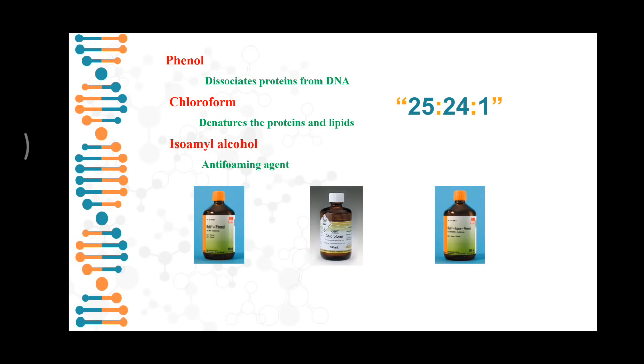The chloroform denatures the proteins as well as lipids. It enhances the efficiency of phenol for denaturation of the protein.